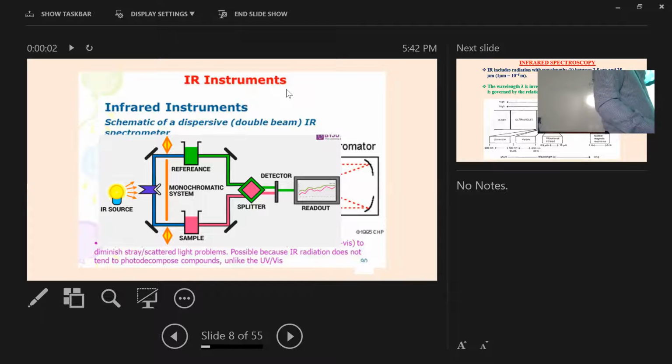Now this is our mirror. This is another mirror, but not all types of mirror are effective here. For IR light, we have specific types of mirror. We normally use a gold mirror, just made of glass and then coated with gold. How expensive is that?